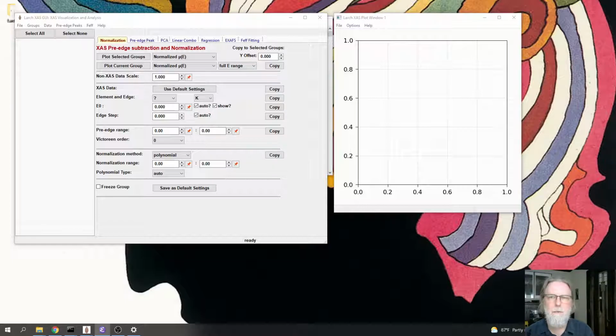And so many crystal structures can be found with pretty similar local structures to the kinds of systems we're analyzing. So the calculation should start with a cluster of atoms that's close, but doesn't need to be perfect. So a crystal structure is, in fact, a good way to start, and one of the reasons is because a lot of crystal structures are available.